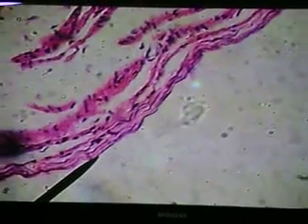Alright. So there we can see the endothelial layer right here. That's the endothelium, and we can see the flattened squamous cells, these endothelial cells. In this case, the nuclei are very long, attenuated nuclei. And in the tunica media, there is no internal elastic membrane whatsoever.